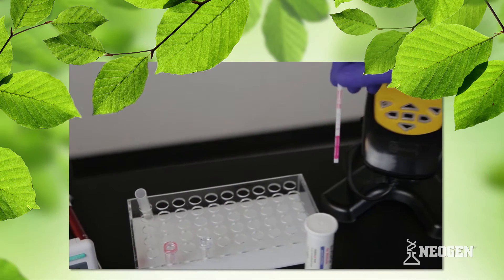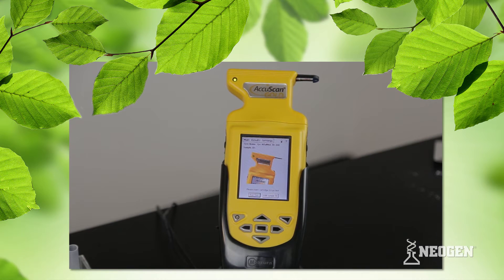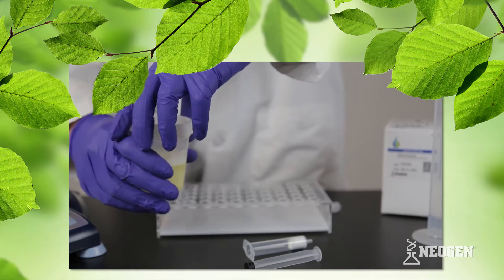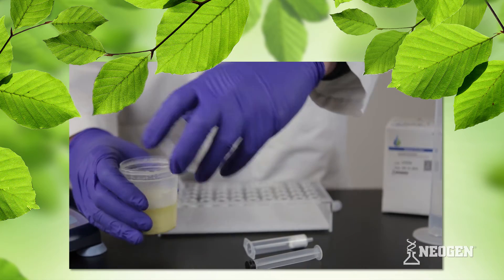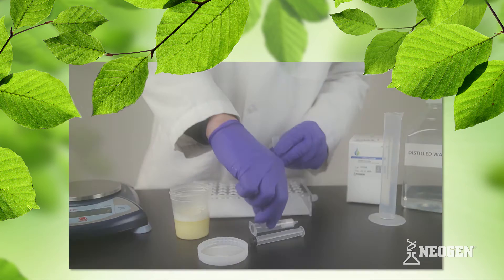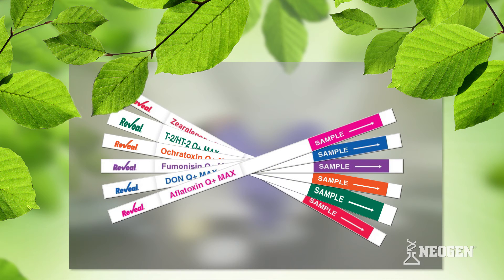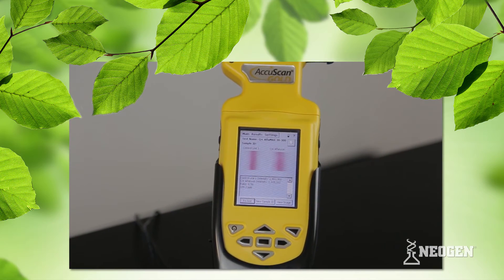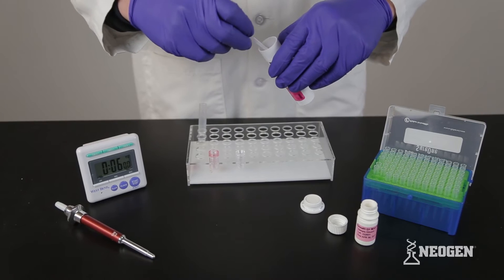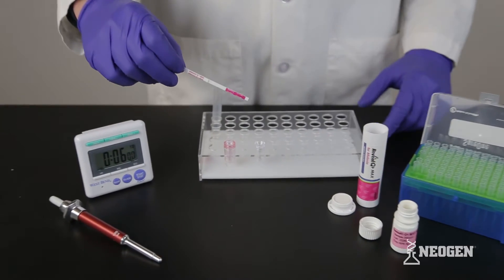In only minutes, use the AccuScan reader to obtain your precise, quantitative, and permanent test result — it's that easy. If you need to test the same sample for a different mycotoxin, simply take another sub-sample from the sample extract, dilute, and place the appropriate test strip in the cup. Minutes later you have another clear, precise, and permanent test result.